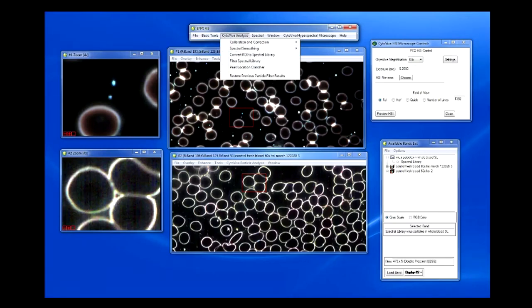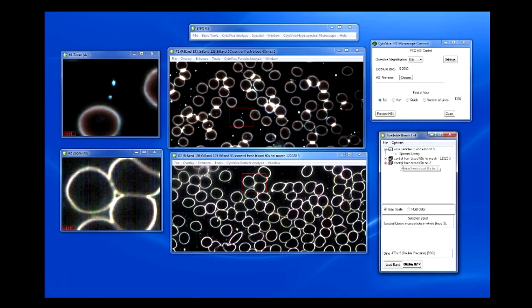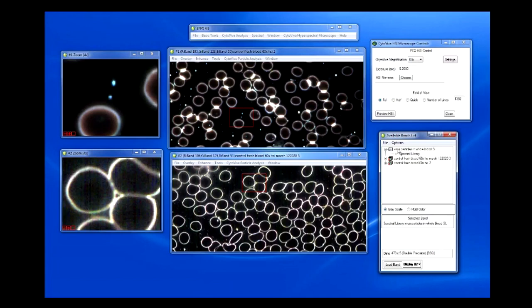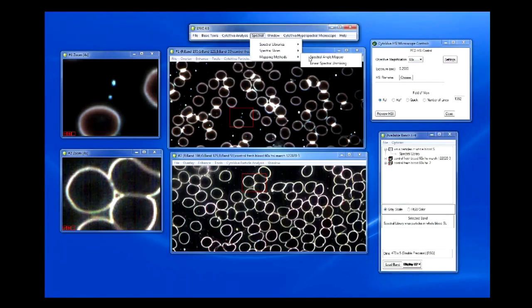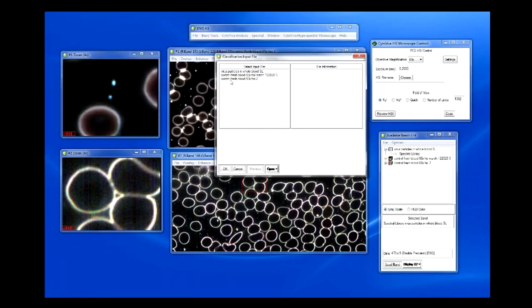There's a feature in the software where you can filter that spectral library against all the pixels of the control image to ensure you don't have false positives. In this window you see three different image files: the infected blood sample, the negative control, and a spectral library that was previously built and filtered. We're going to take this filtered spectral library and map it against the positive control sample using the mapping methods option.